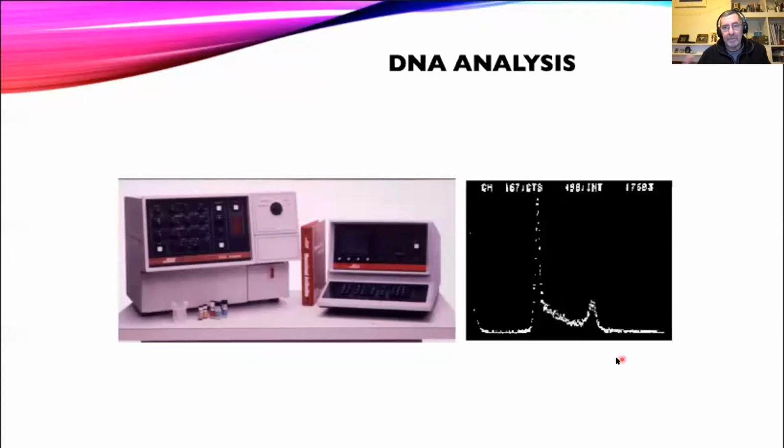And I'd come from a point where I was doing this DNA analysis by image analysis, and it used to take me 2 hours to construct a histogram like this. In a flow cytometer, I suddenly found that I could do the same thing in a few seconds, or at least a minute or so. It changed my life completely, which is why I'm still here. You know, flow cytometry is a great technique.